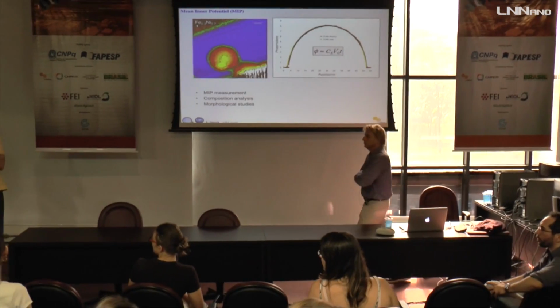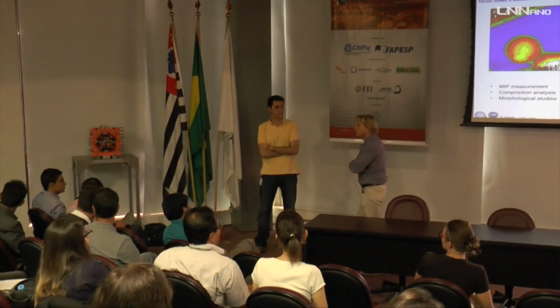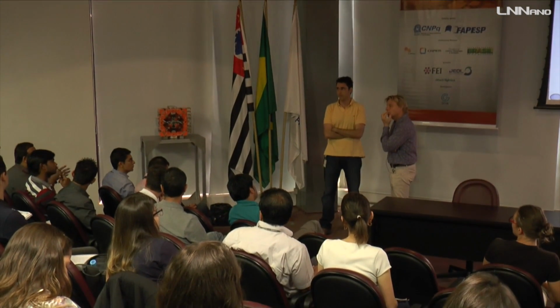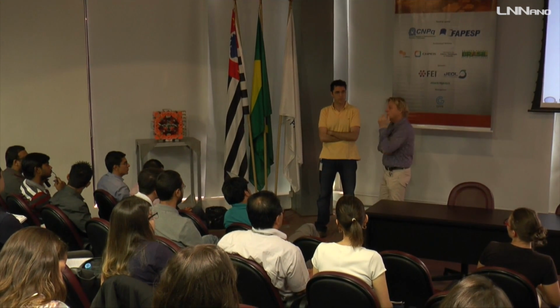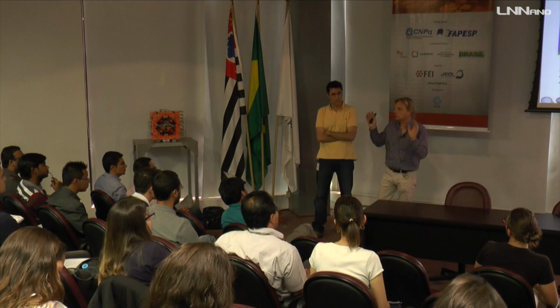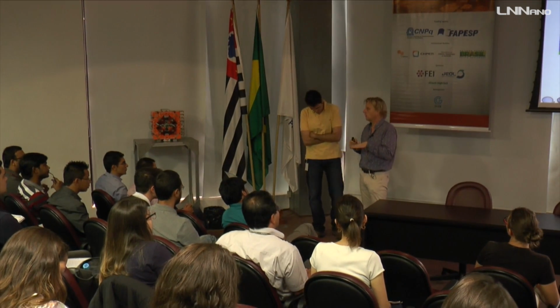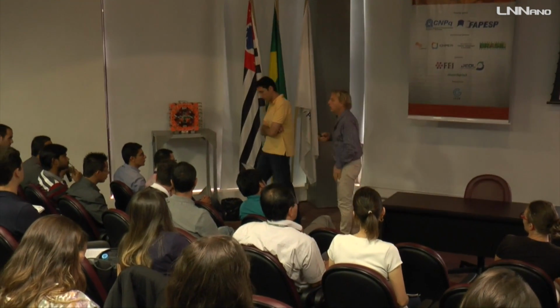Regarding those carbon nanotube guns, how were they modified? Have you modified the field emission gun? Meaning a cold FEG or Schottky FEG, how were they modified? This experiment I was showing was done on a Tecnai microscope. This is just to prove that we can use that field emission gun. So it's a normal cold FEG, yeah?